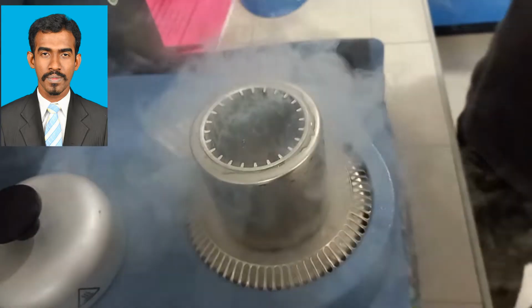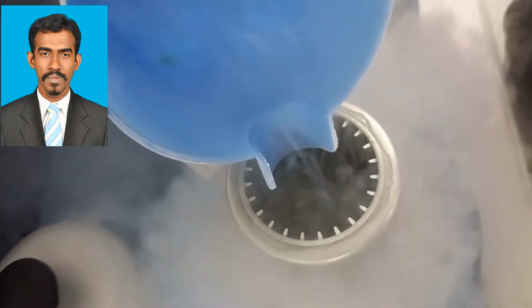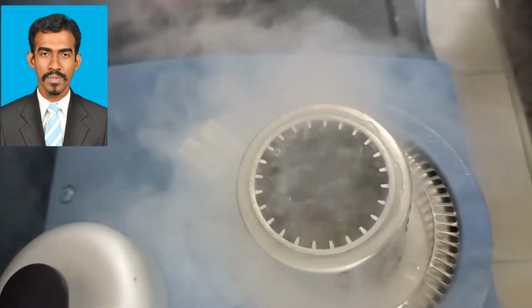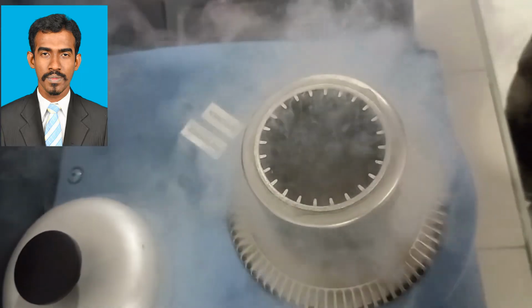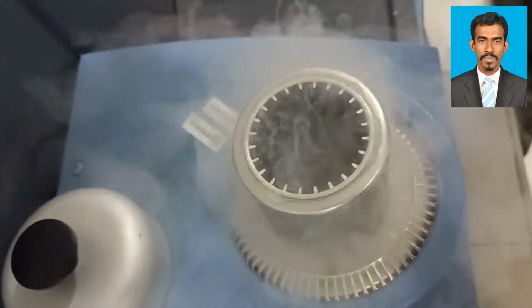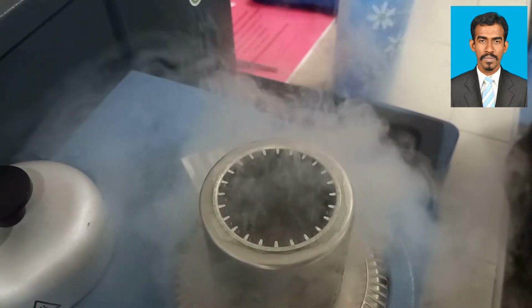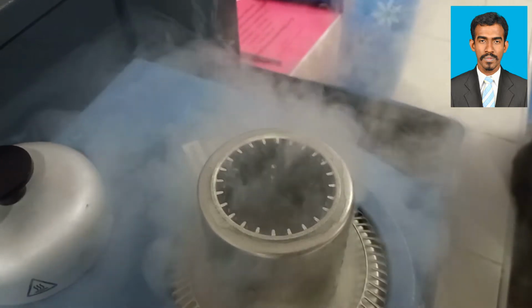So continuously we have to pour this liquid nitrogen for the cooling purpose till our curve reaches minus 100 centigrade. This should be above half level of this cup.